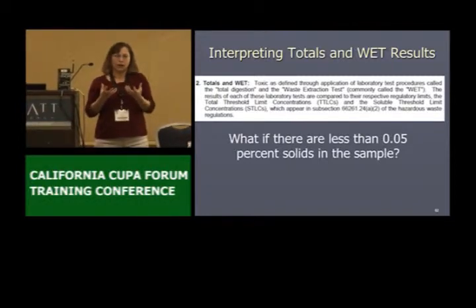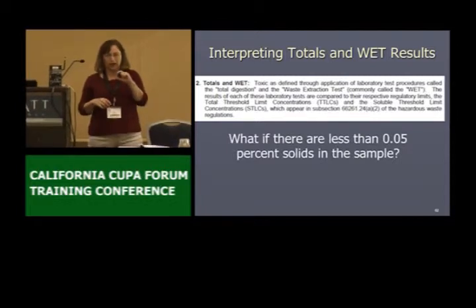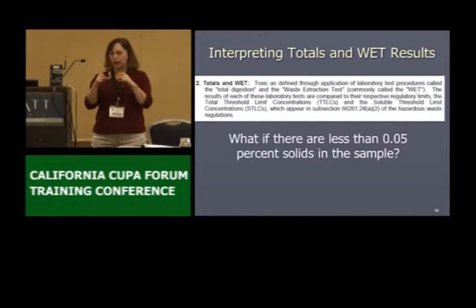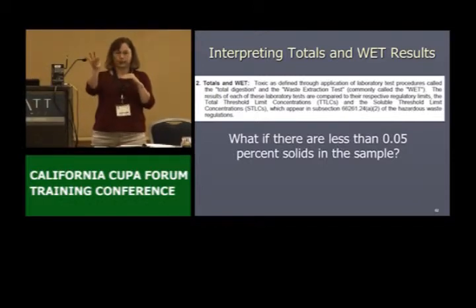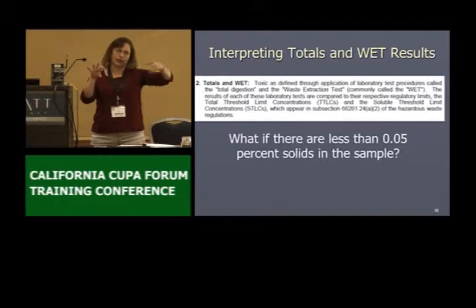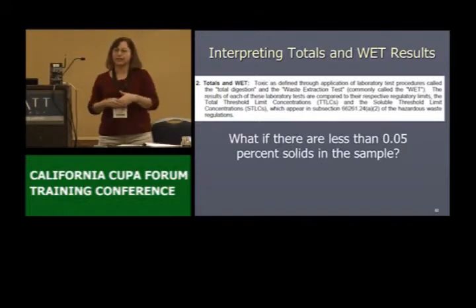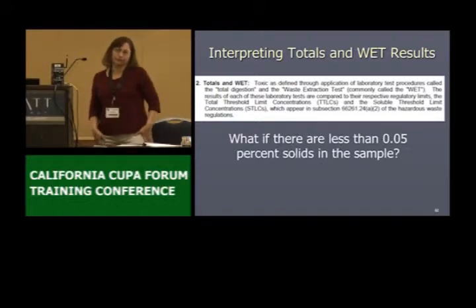Same thing if you've already got a water sample to begin with, it's not going to have anything leach out of it and go to the landfill unless there's solids in it. If you've got this much solids and this much water in it, then the tests become more complicated, where we actually have to filter it, take this liquid, put it aside, take the solid, do the extraction on it, get the liquid off of that, and then recombine the two, because that's really what's going to happen when you put your sample in a landfill and it rains. The liquid's going to trickle right down, and the solid's going to slowly extract over time. So if you have a liquid sample to begin with, you should be comparing it to the STLC results and ask the lab for STLC, and that way we'll start with the filtering step too.